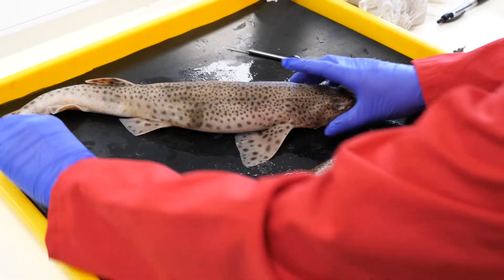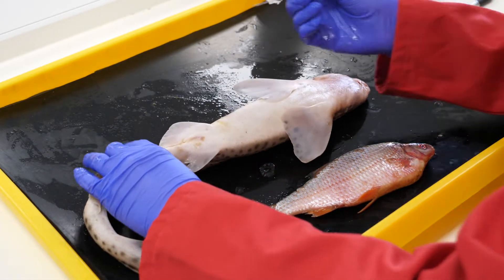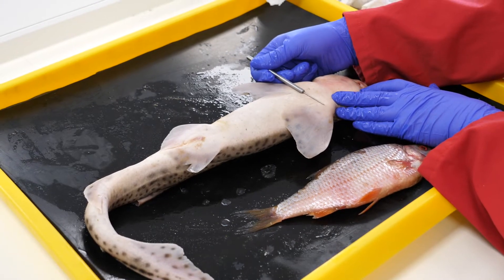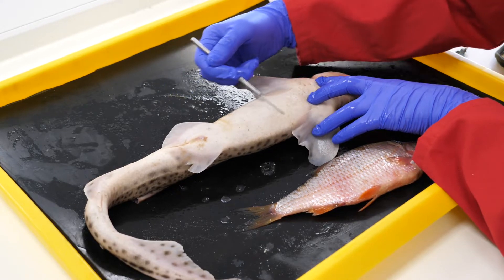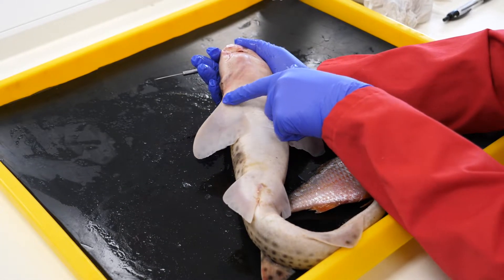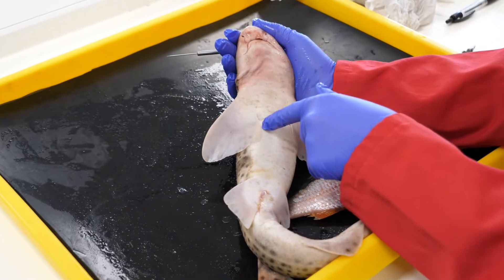In terms of dissecting these fish — for those of you who will be coming in for your practicals to dissect the dogfish — you're going to turn it over and cut using a scalpel or scissors from the cloaca in a straight line all the way up. There is a bar between the pectoral fins, so cut up to there, then cut down the sides so you've got a big rectangular opening to see inside the stomach. Once you've seen the stomach contents, you can cut up to see the gills. You cut across the bar that runs between the pectoral fins — you might need strong scissors or a scalpel — and cut up and under all the way to the mouth in order to see the gills underneath.